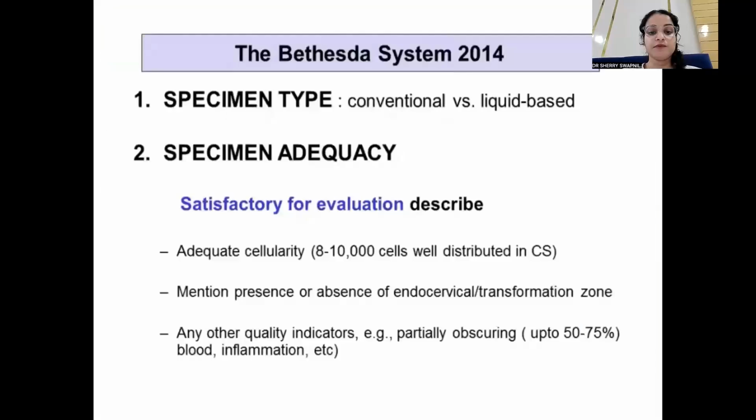Next slide, please. So this I have already discussed, the specimen adequacy criteria for conventional and liquid base. Next slide, please.